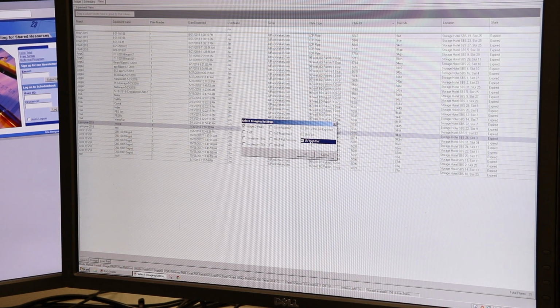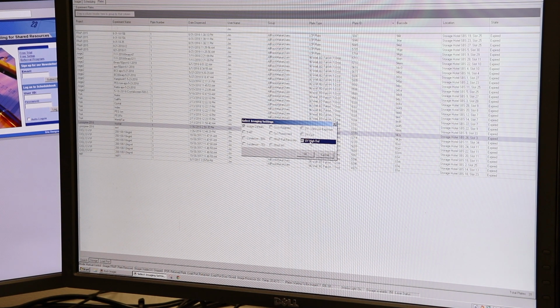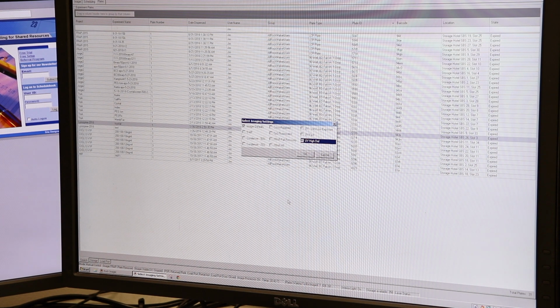In the next segment, I'll show you how to image completely manually so you can adjust the exposure and fine-tune it. So you'll do that, hit OK. It'll bring the plate up and only image the wells that you identified in RockImager that you wanted it to. That will save time and storage space.